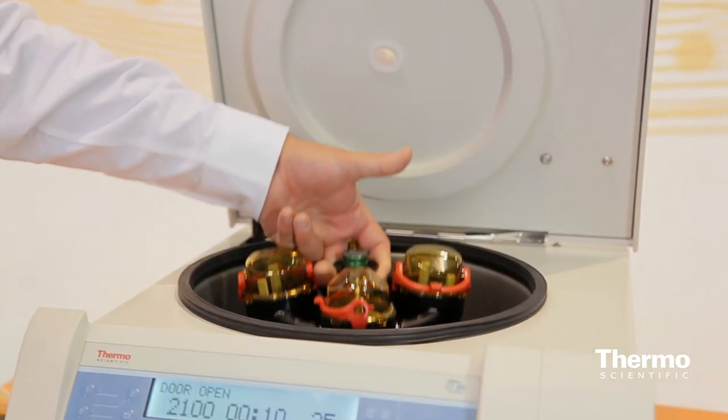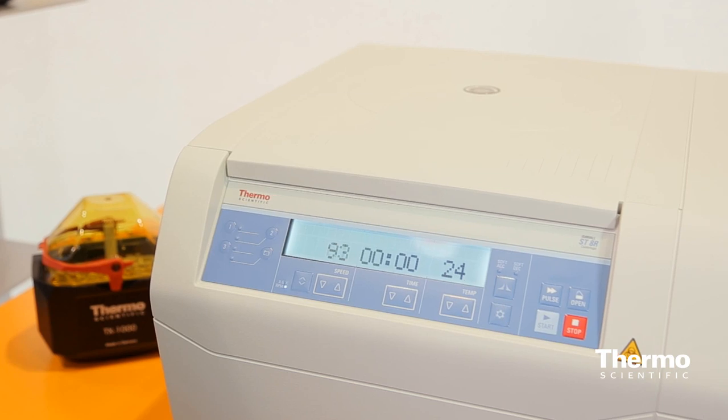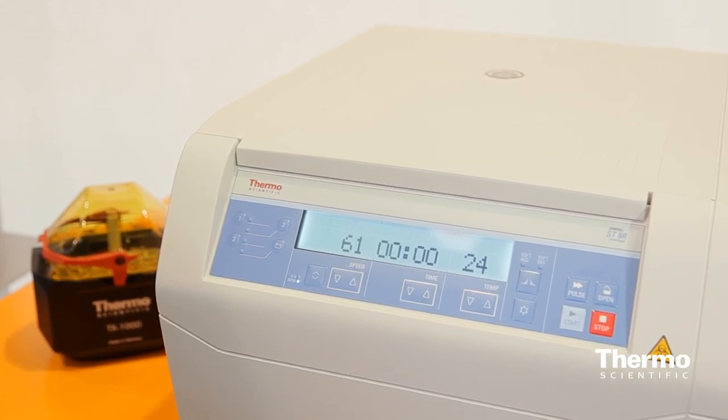In particular for the clinical market, we can do blood tubes of all sizes. We can do microplates for some of the molecular tests, microtubes, or even cell culture tubes. That's the fits-in part of it.